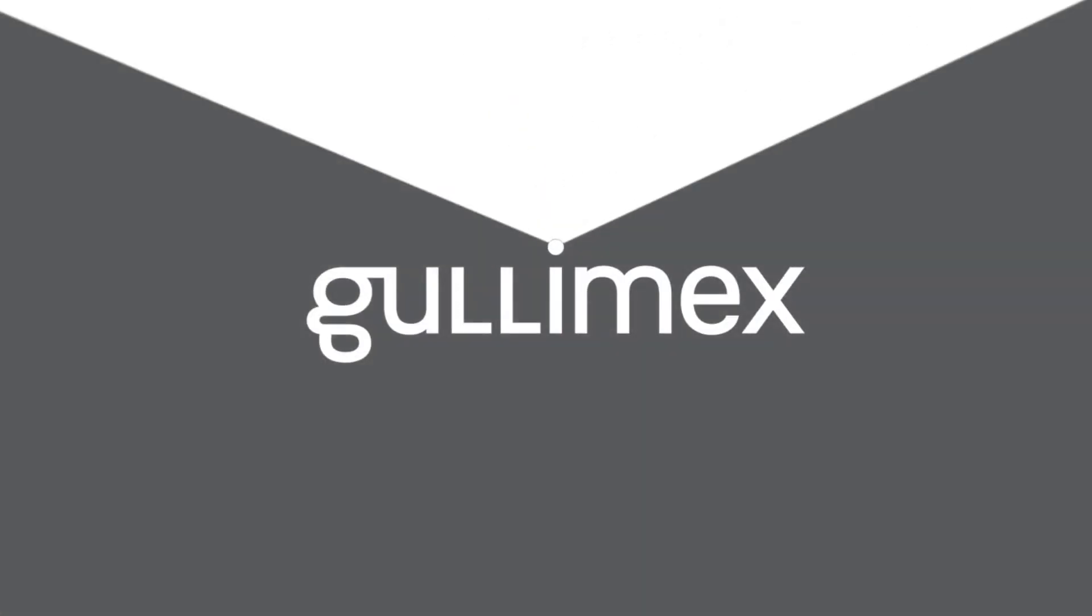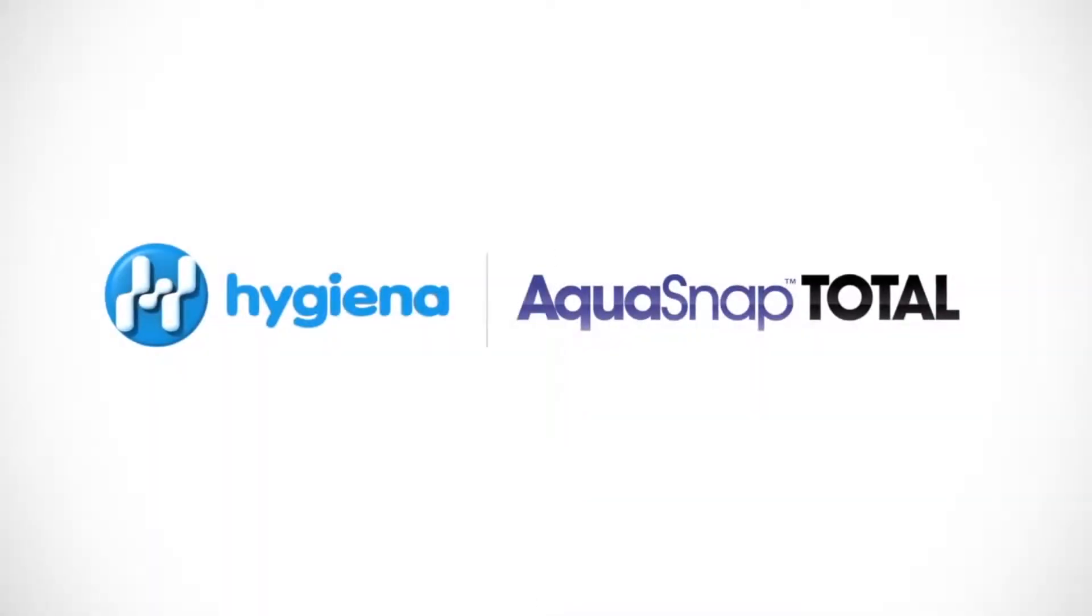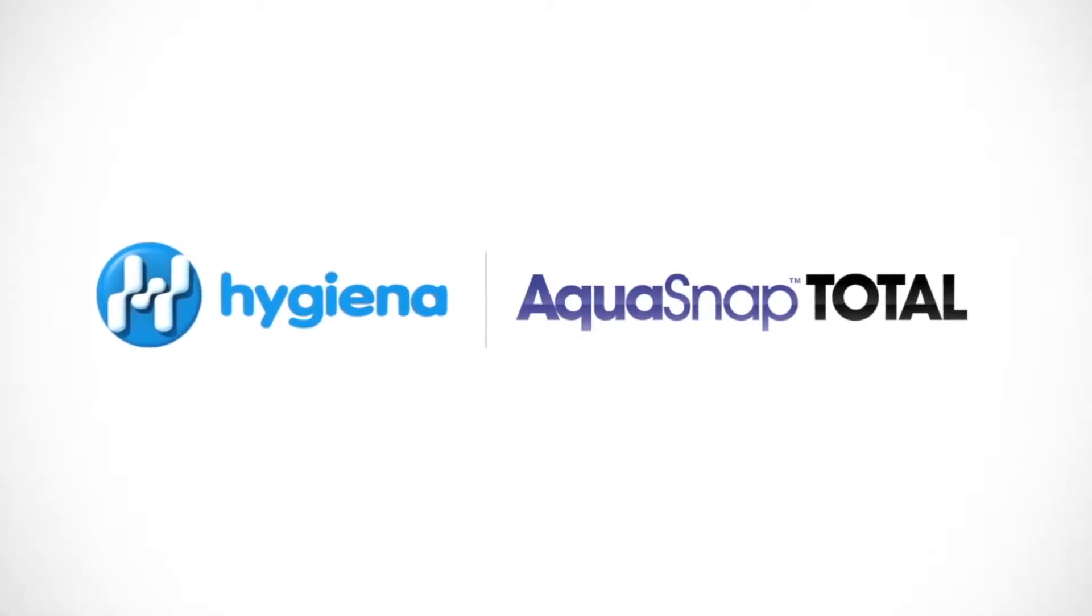This instructional video will demonstrate the proper use of AquaSnap, Hygiena's ATP test for water samples.